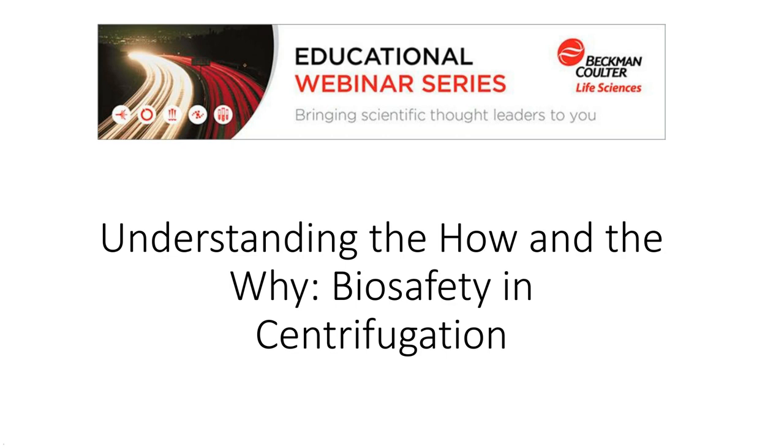I would add that you shouldn't have to do that. That adds a lot of time to what needs to be done in the lab. I think the eyeball there can tell you whether that needs to be done because tubes leak, bottles leak. You can often see that there's been a spill or even a minor spill. So that might require a quick rinse in a rotor to take care of. The other telltale sign is what's at the bottom of the centrifuge chamber. If there's been a bad leak, you'll see it.